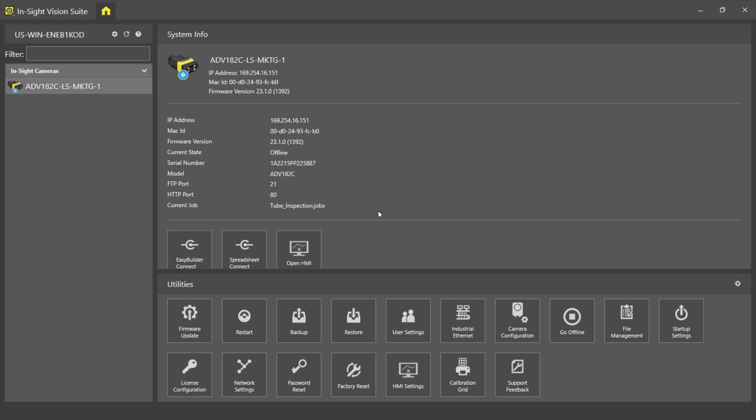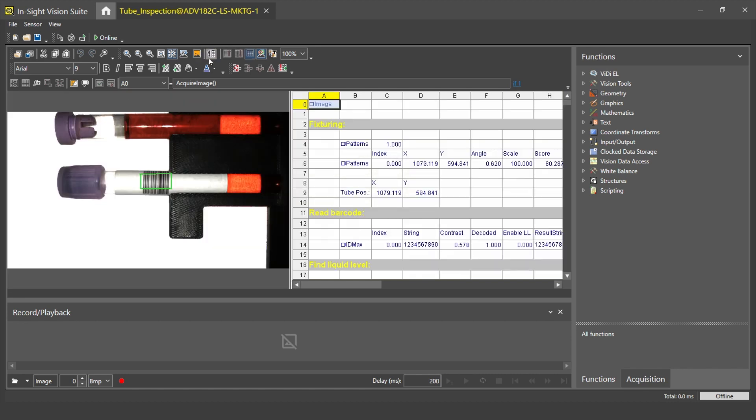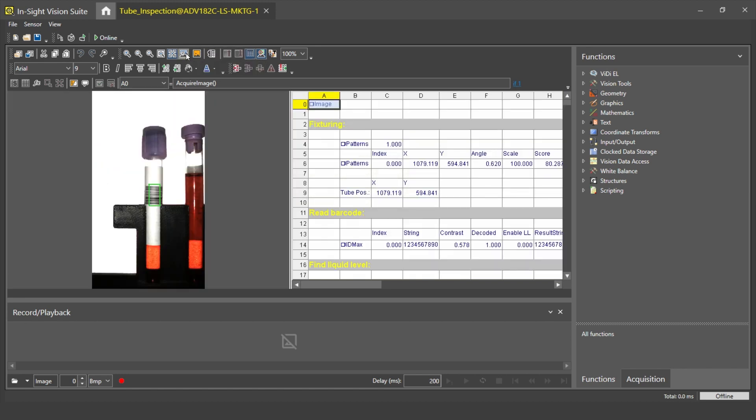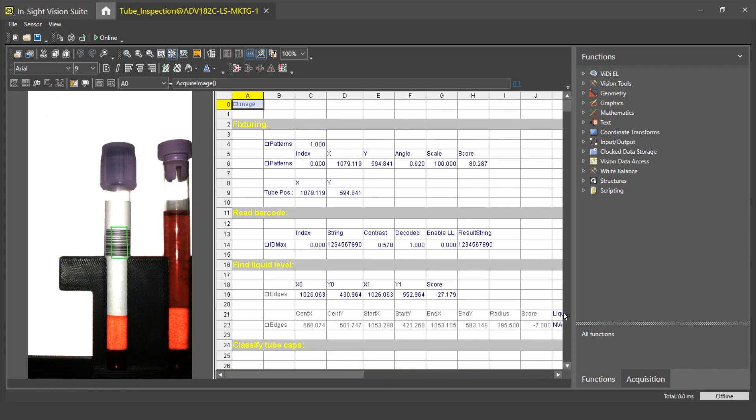Before I begin the demonstration, I connect to the spreadsheet editor in the In-Sight Vision Suite to edit my job file. I quickly adjust the screen to make sure that we can see the image better. As you can see, I already created a basic job file which can fixture the test tube, read the 5mm barcode from them, and also detect the liquid level.